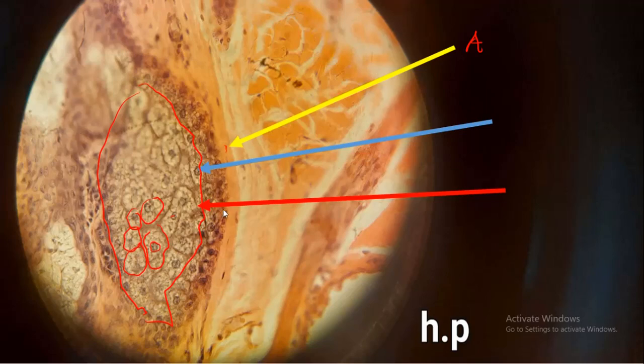The other component being pointed at is the plasma membrane. And this blue arrow is simply pointing at the nucleus. So these are the contents that you need to know. It's not just about drawing, it's also about preparing for the exams. Because your work will be projected, you need to be able to label, like the way I have labeled this part.